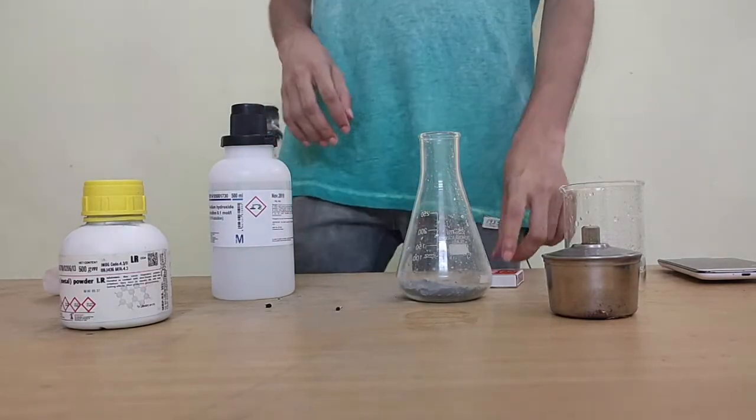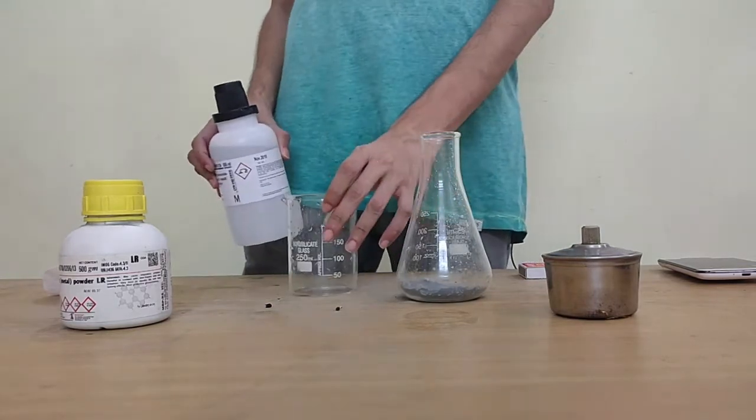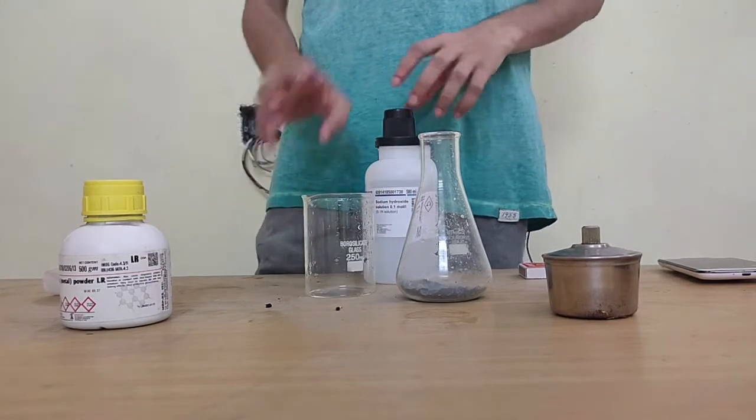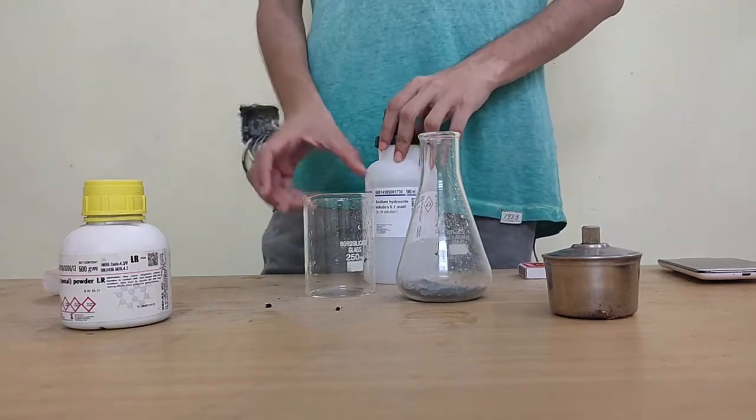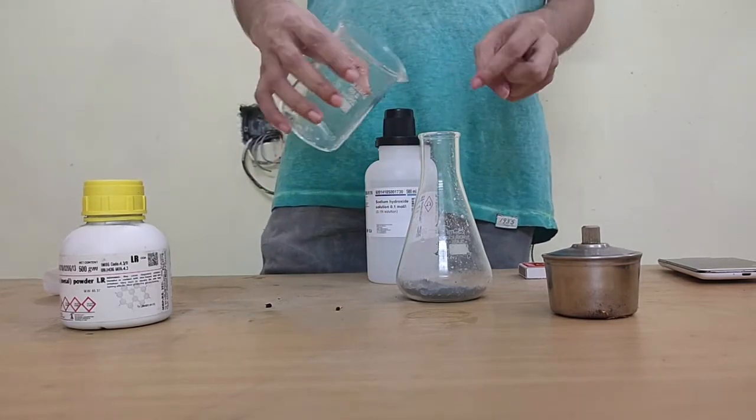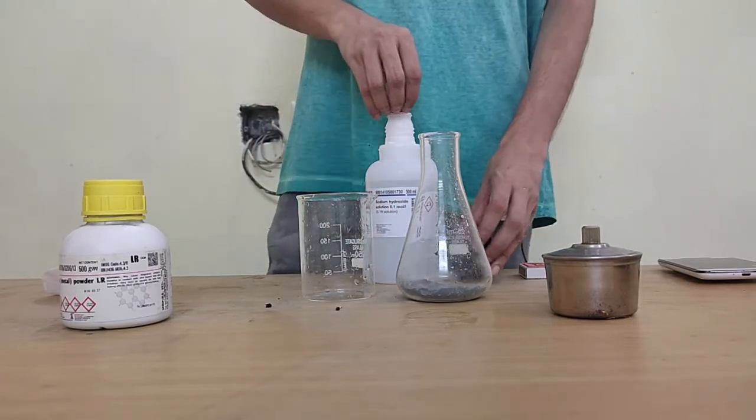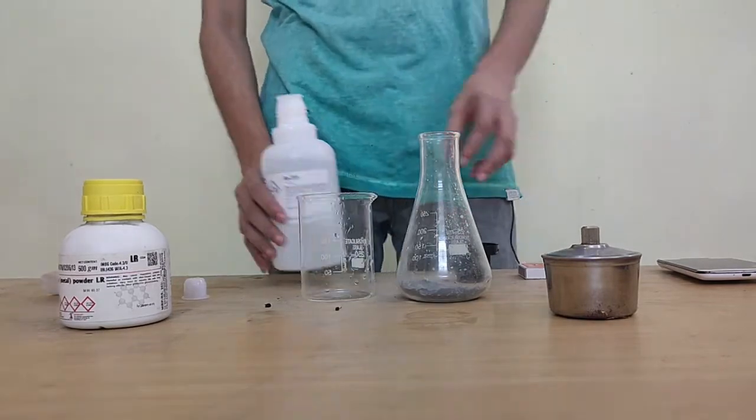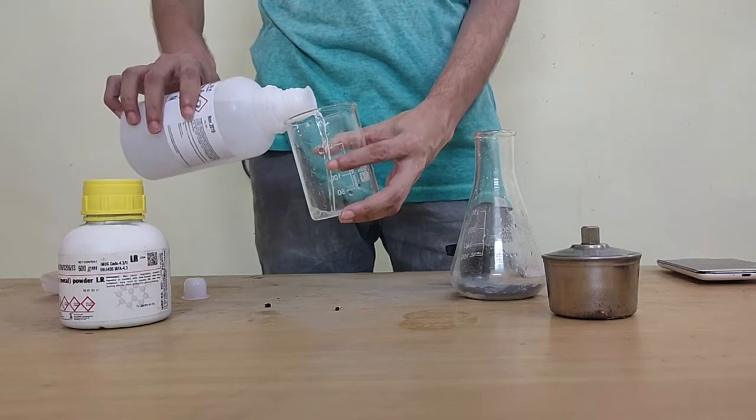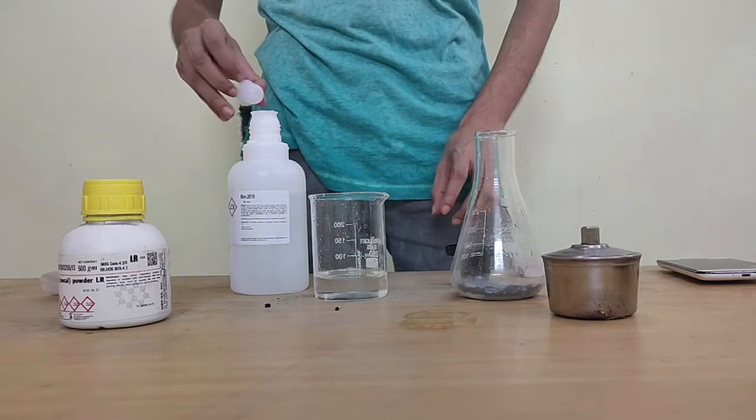The next thing I need to do is add my second reactant to this container and that is my base. Since the base is strong and I need to be extra careful, I'm gonna add it to the beaker first and then add it to this. The advantage of that is beakers have this kind of like a notch over here that helps me pour a liquid easily which a bottle does not have. First I'll pour my base in this beaker. There you go, that's a bit too much but that is fine.